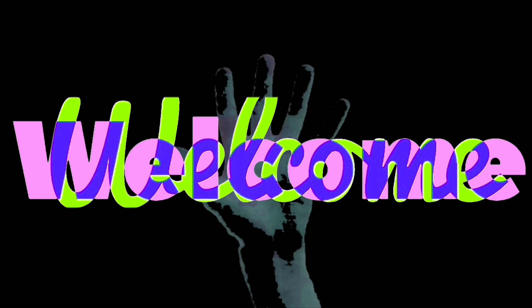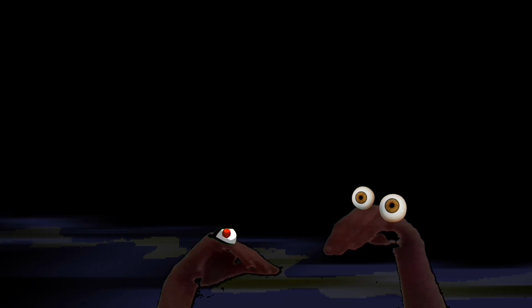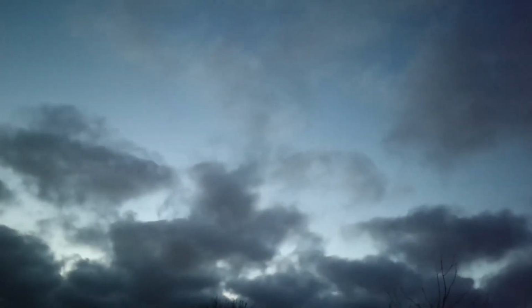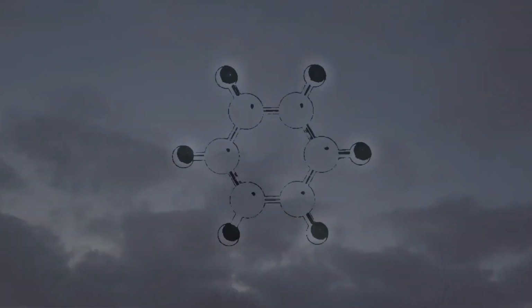Hello, today's compound is a pleasant one. It finds uses in the flavor and perfume industry. It has a pleasant aroma of honey and cinnamon. As well as a fragrance, it is chemically aromatic due to it containing a benzene ring.